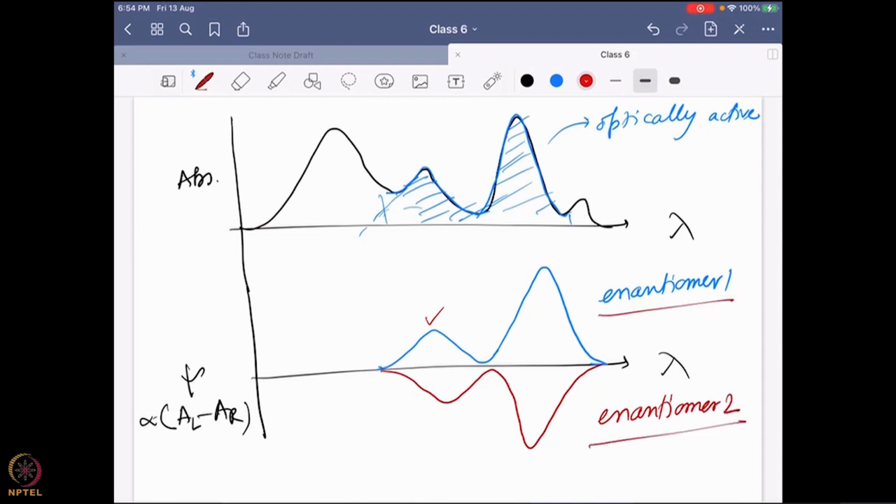So we'll stop over here because the time is almost up. In the next class, we'll look into some real life samples, starting with some proteins, and find out how the CD spectra can tell us what the overall structure of the molecule is. And then we'll also discuss ORD data, that means optical rotary dispersion versus CD, which will be better spectra to follow the chiral activity of a molecule. Should it be optical rotation or should it be ellipticity? That thing we will discuss.